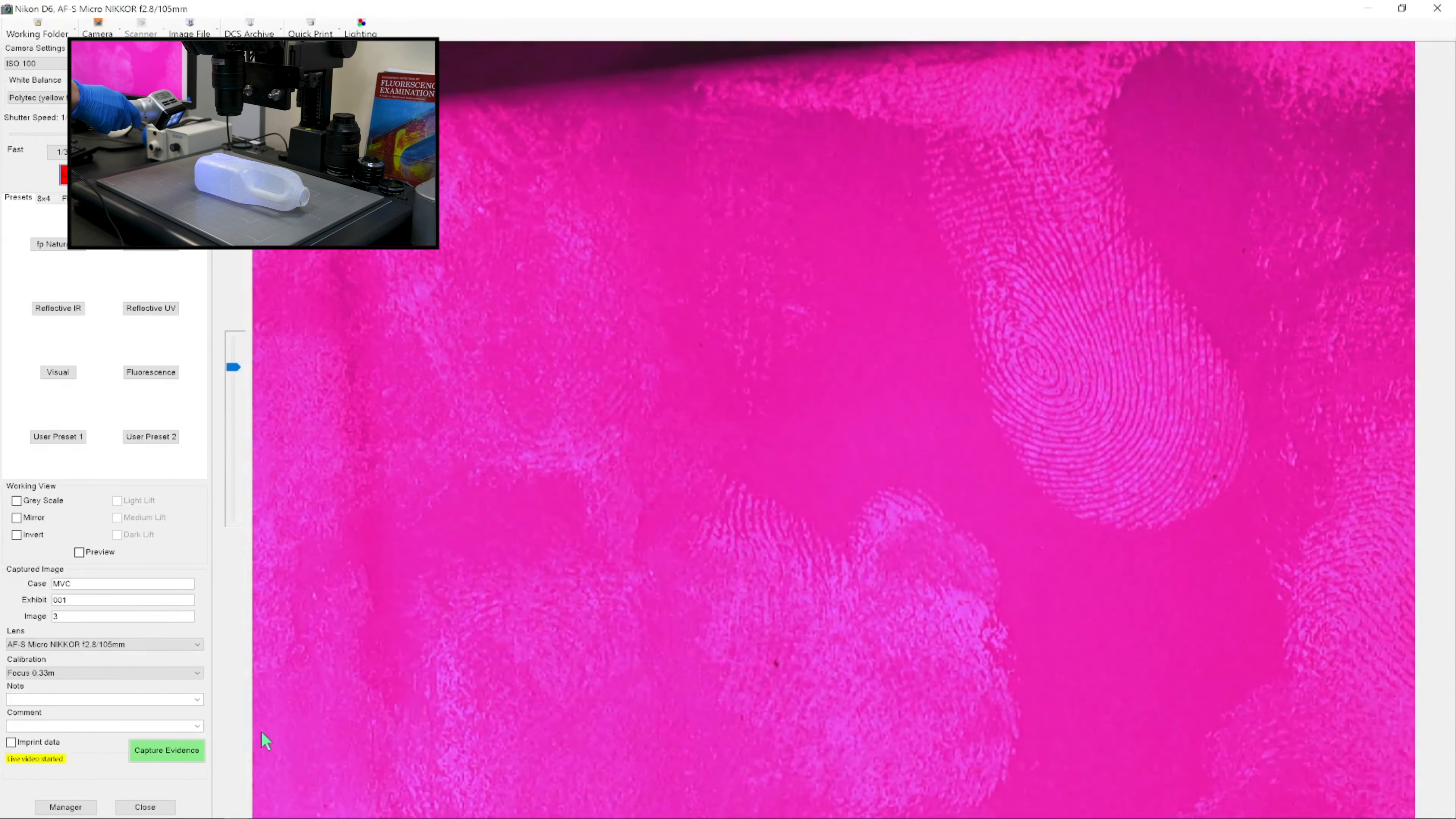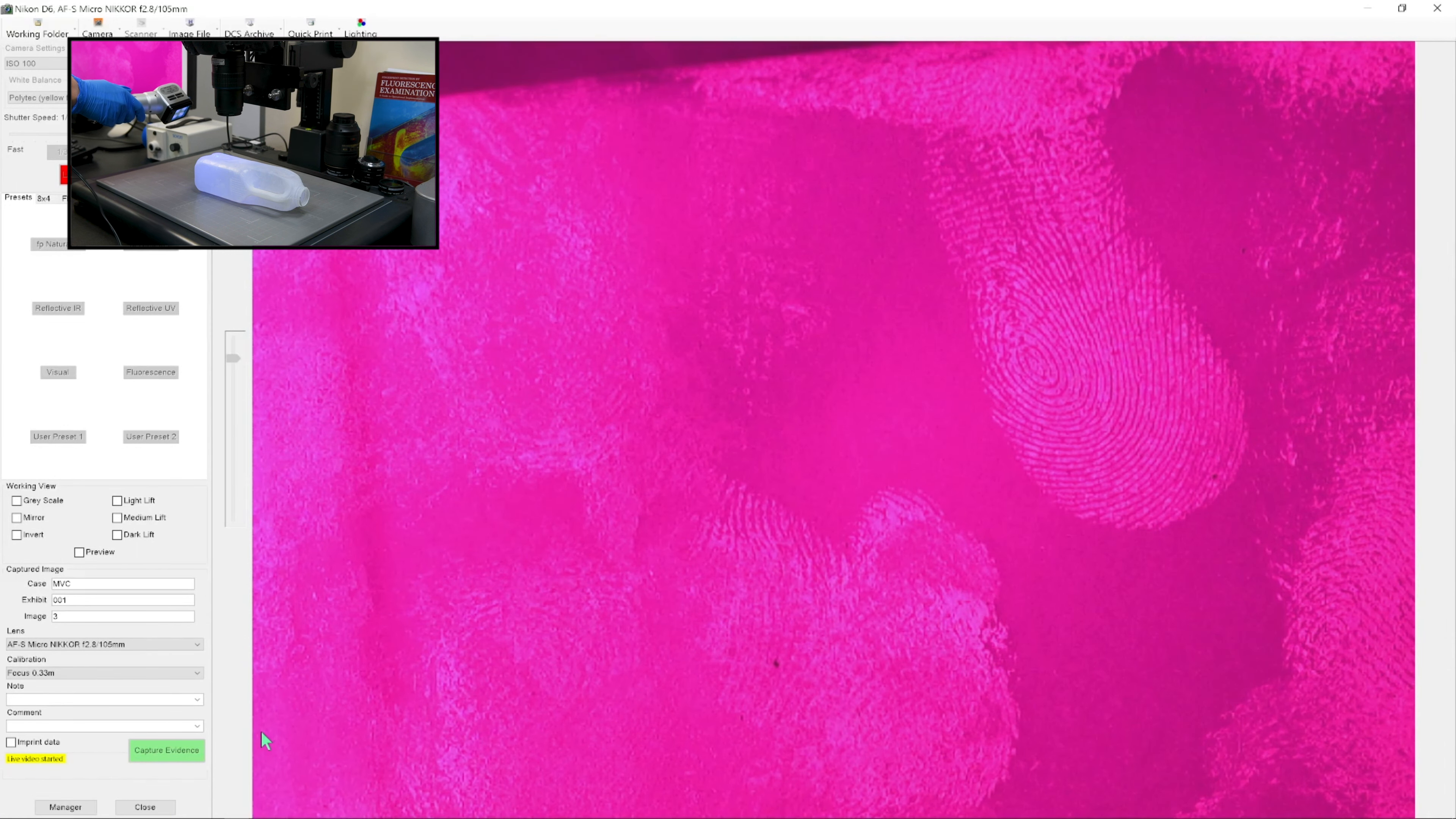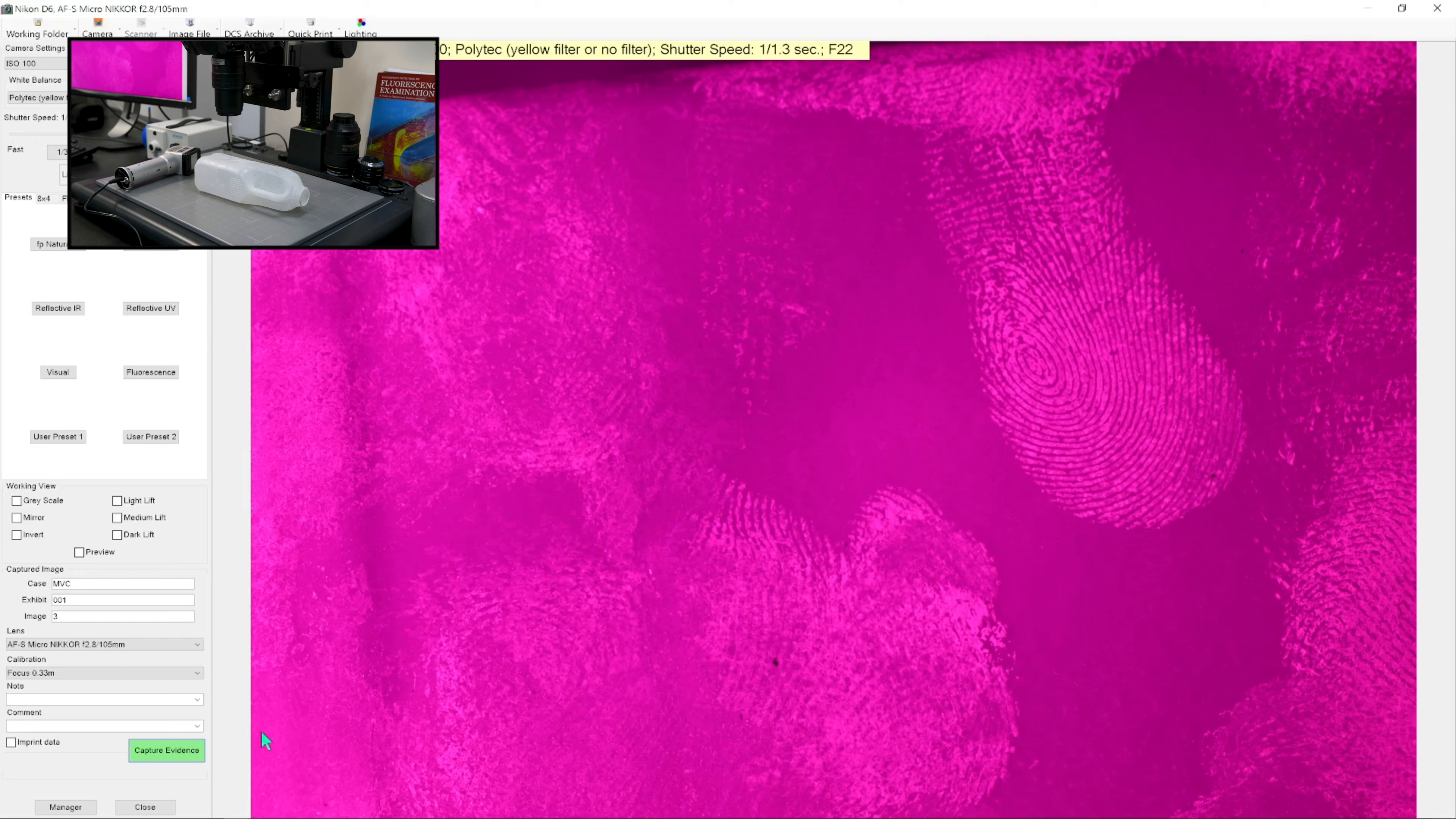Now, what you will notice is that the contrast that's achieved in UV light is completely different to the contrast that we were seeing visibly, and is also completely different to what we are visibly seeing on the bottle.